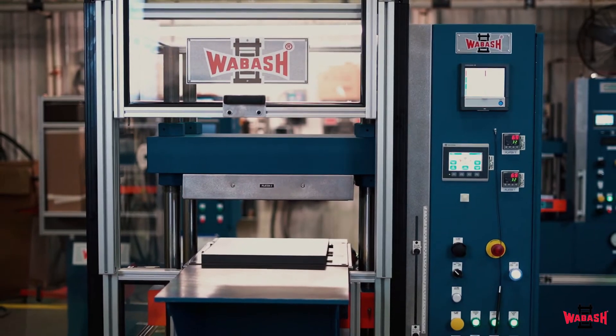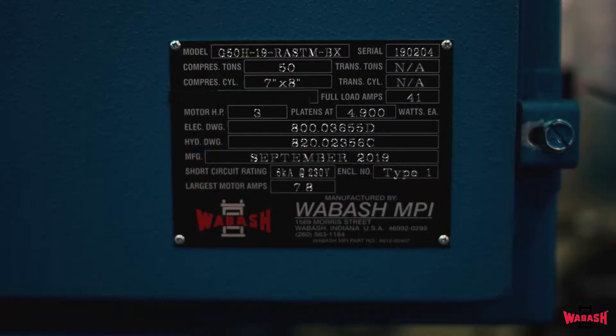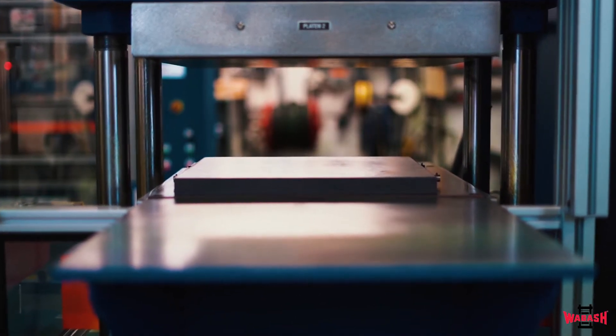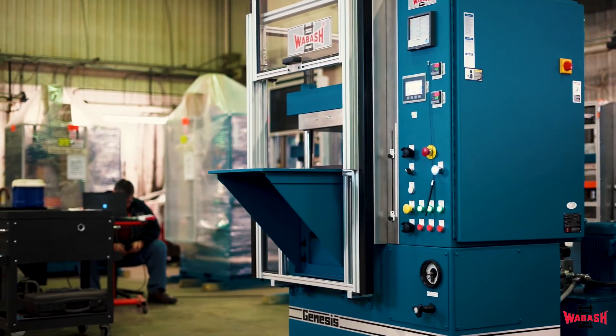Today we will be reviewing our Wabash rubber ASTM press, model G50H-19-R ASTM. This is a 50-ton press with 19-inch electrically heated steel platens. It is available on 460, 230, or 208 three-phase power.